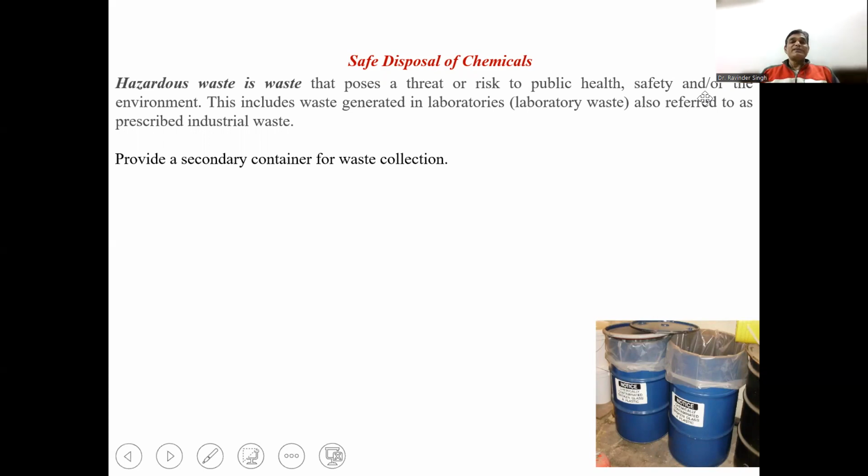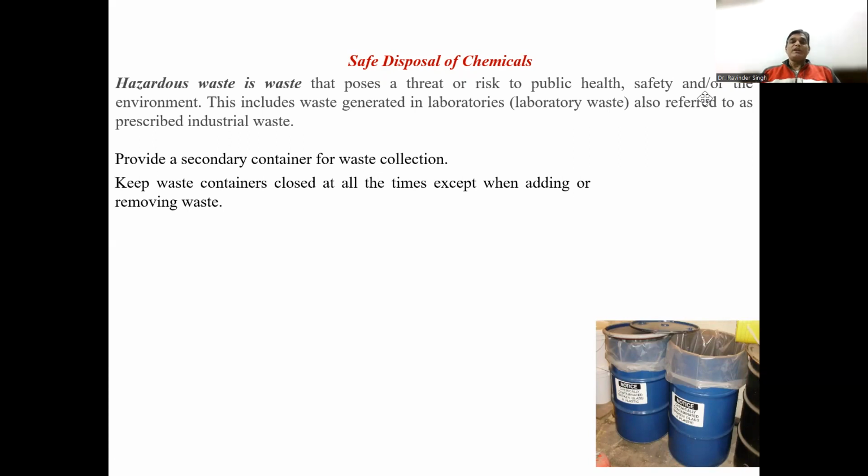We must provide a secondary container for the waste collection. Always keep the waste container closed at all times except when adding or removing waste, because the vapors and smell will cause pollution in the environment through air pollution.